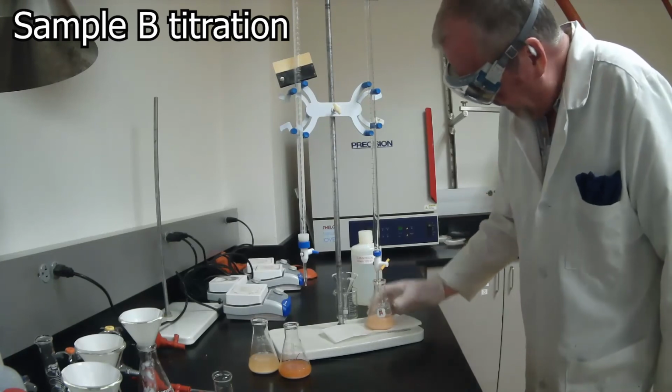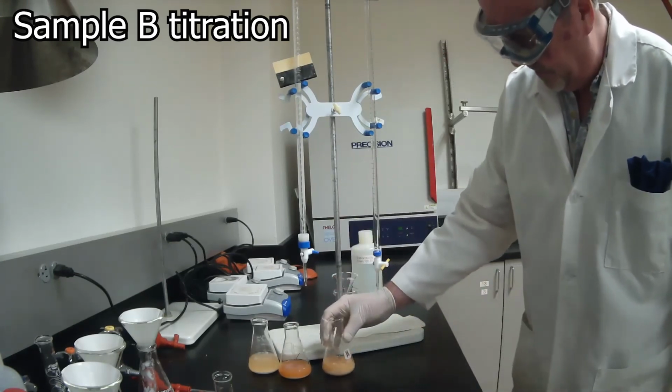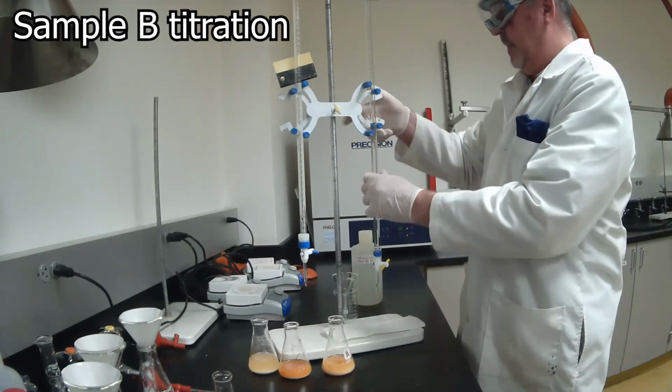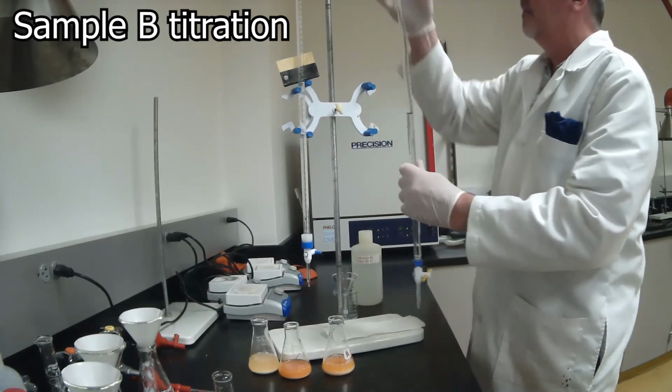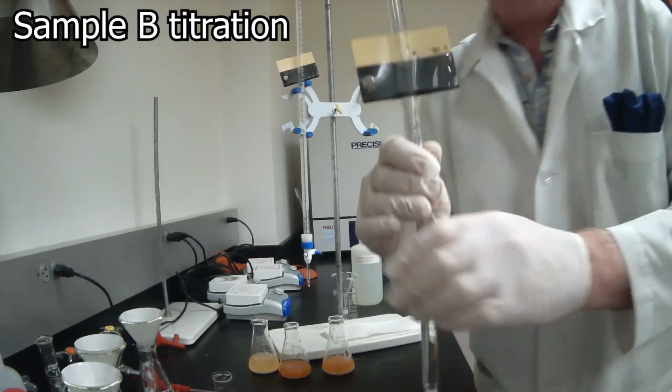This is for the repeat of sample B. Okay, we've got the orange color persisting for 30 seconds. And so we're going to try to look at the meniscus again. The major division mark that we just went past is 30, so we're between 30 and 30.5. So we're trying to see if we can read the bottom of that meniscus.